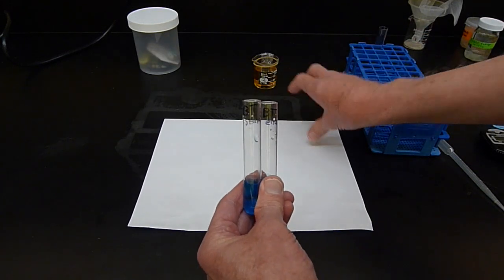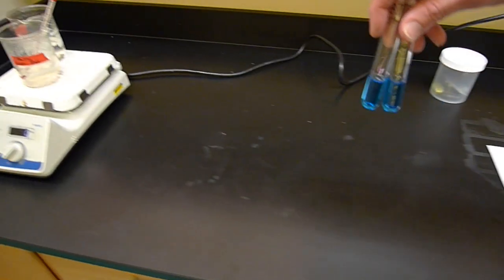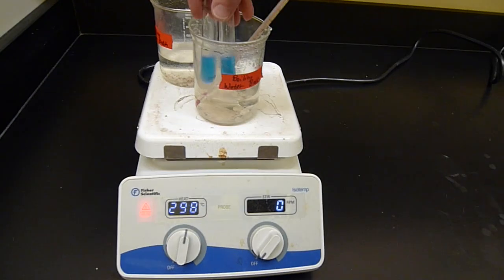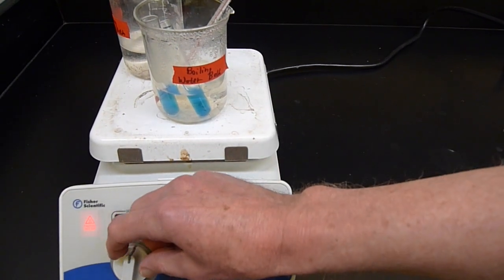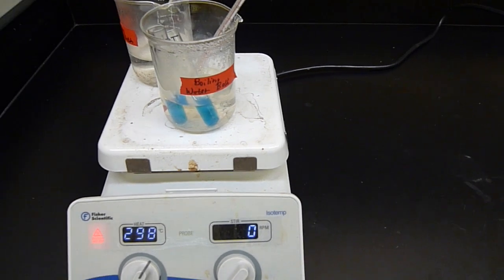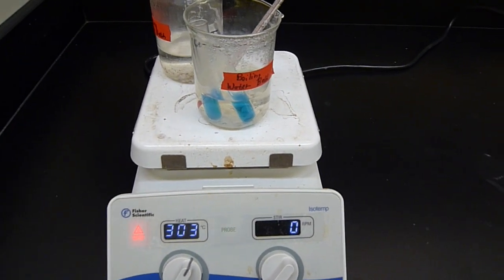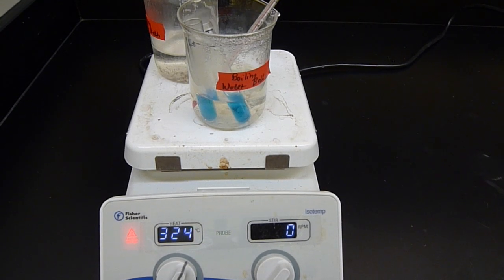You got all that? All right, so to do the Benedict's test, remember we have to cook this stuff. We got to heat it up in boiling water. Here's a boiling water bath. Pretty close to boiling. I'll give it a little boost here. We're going to let that sit for about 5 minutes or so and then come back and take a look at those tubes. So in 5 minutes we'll be back with the end of the Benedict's test.